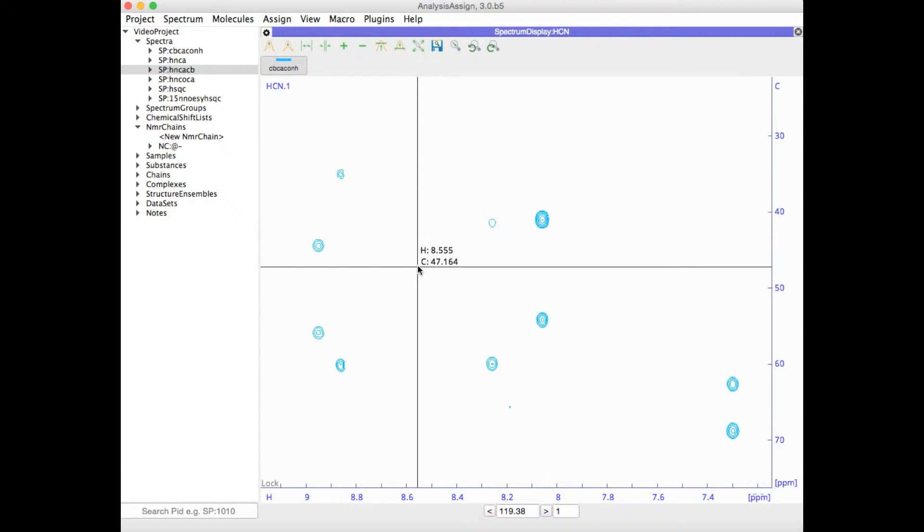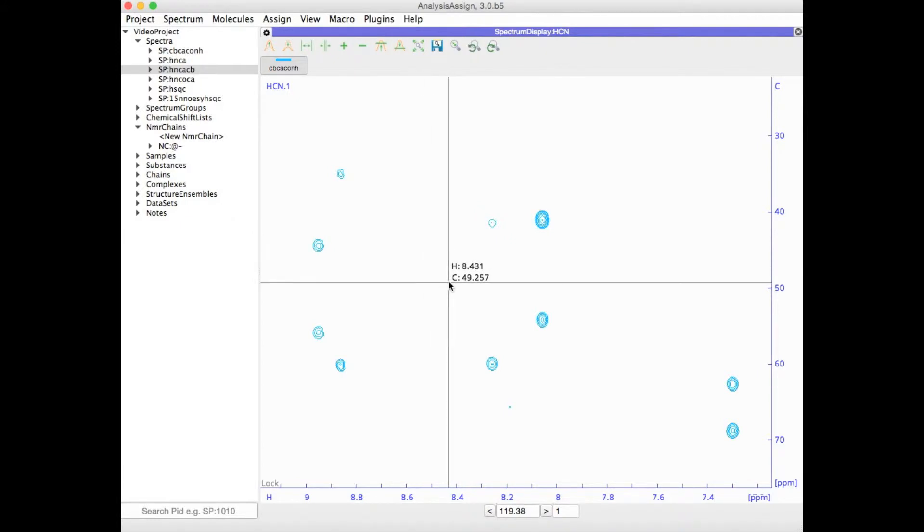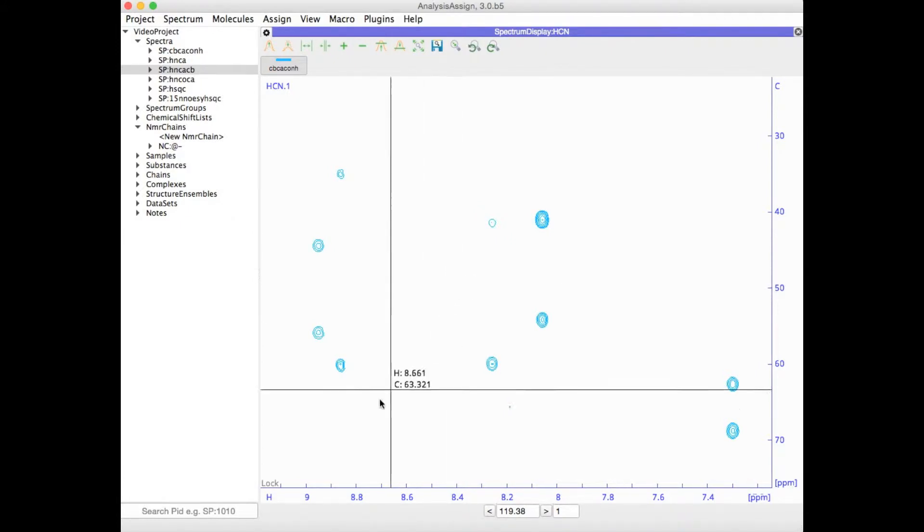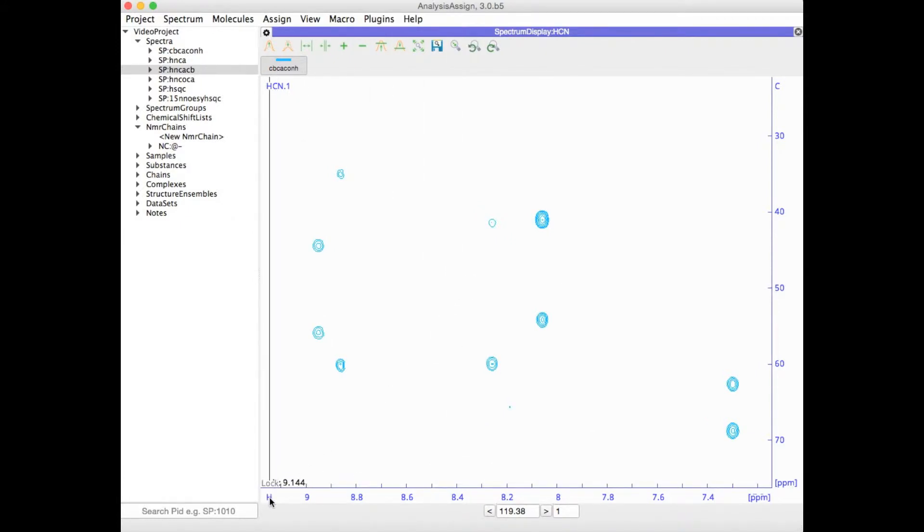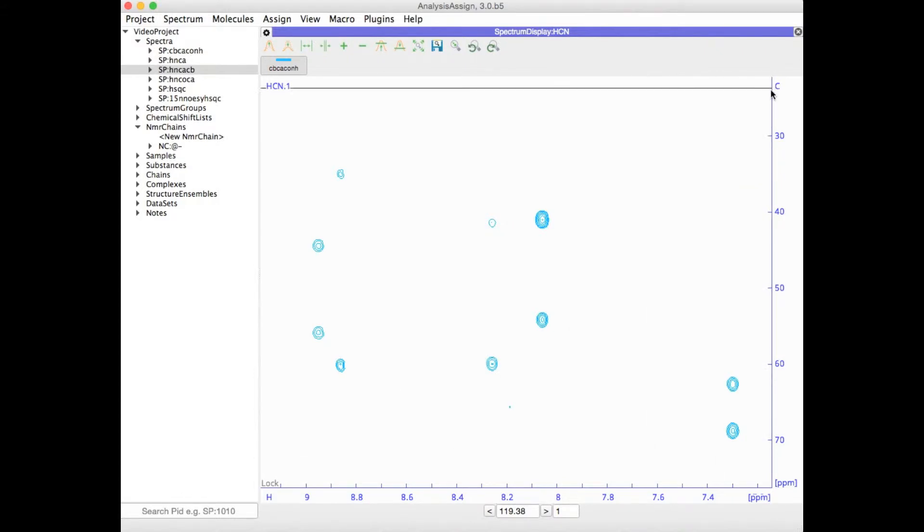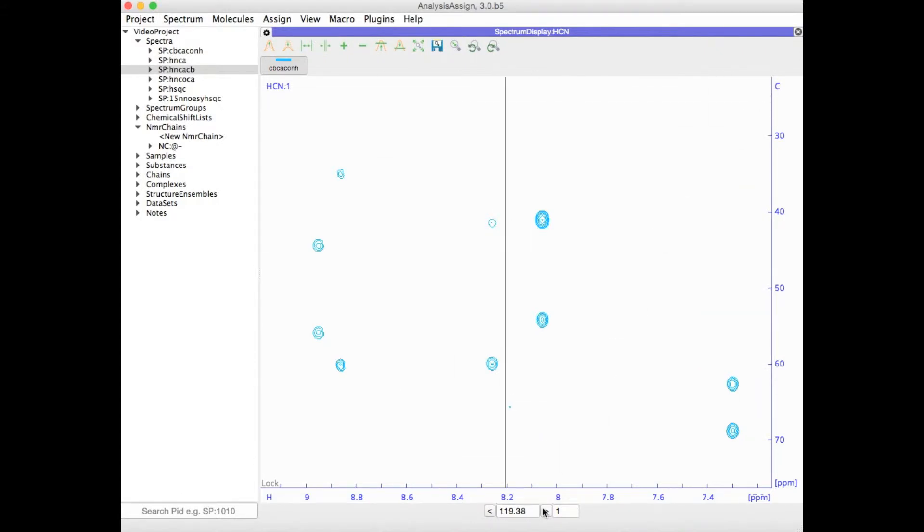Here I've got a triple resonance spectrum. It's got protons along the X axis, carbon along the Y axis, and nitrogen in Z.